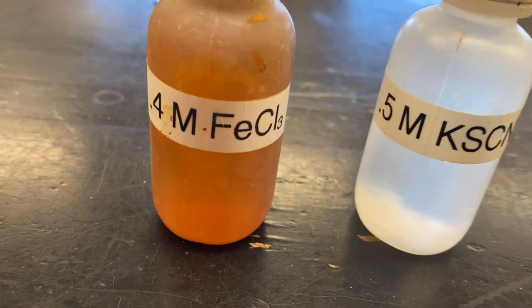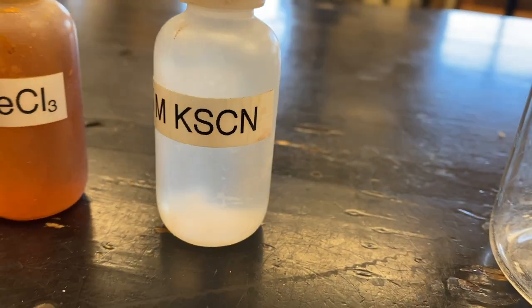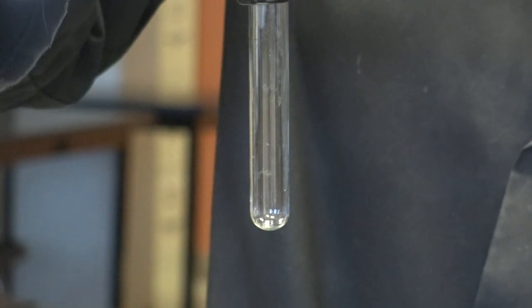To make this work, I've mixed up some 0.4 molar iron 3 chloride and some 0.5 molar potassium thiocyanate. We'll go ahead and put some drops of potassium thiocyanate in our test tube.